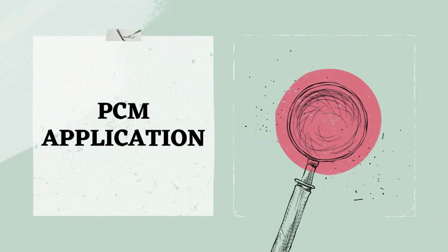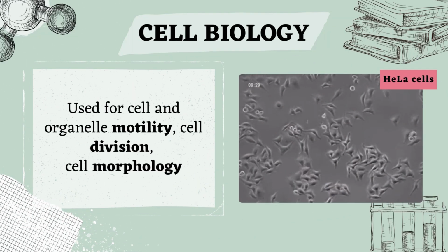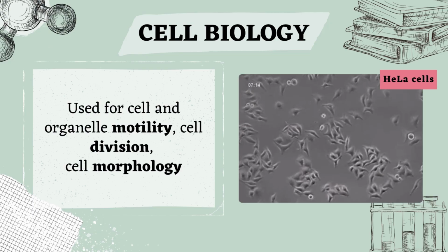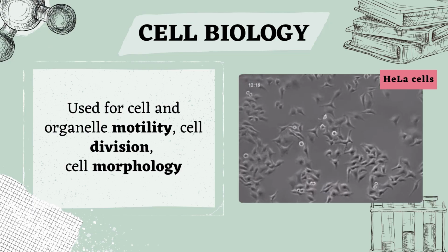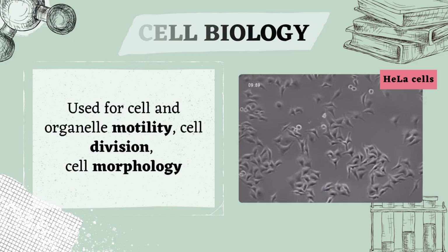And now, introducing the last topic, PCM applications. One of the most common fields of application is cell biology. PCM is very much used for cell and organelle motility, cell division, and cell morphology. As we can see in the video, this is a time-lapse of HeLa cells.